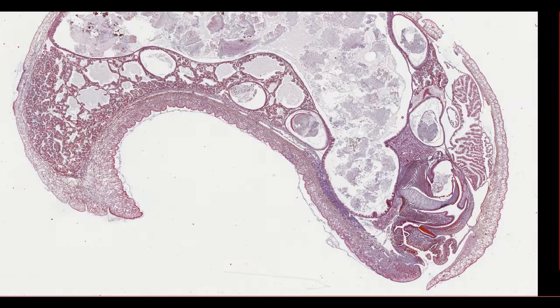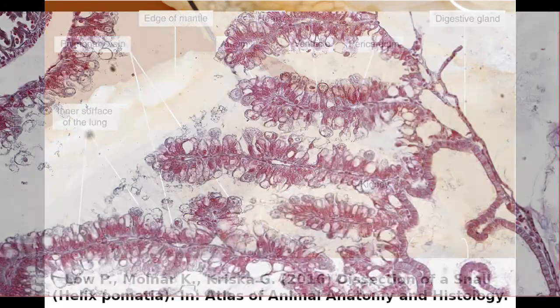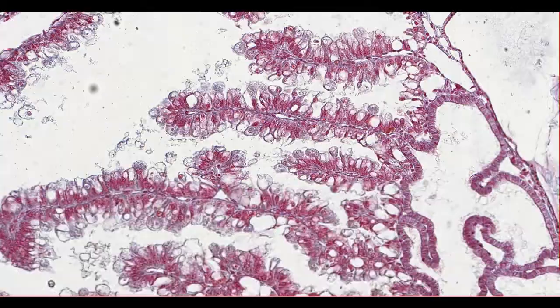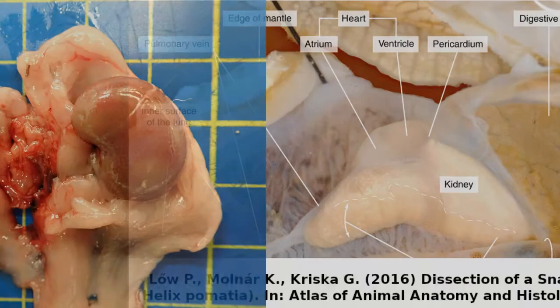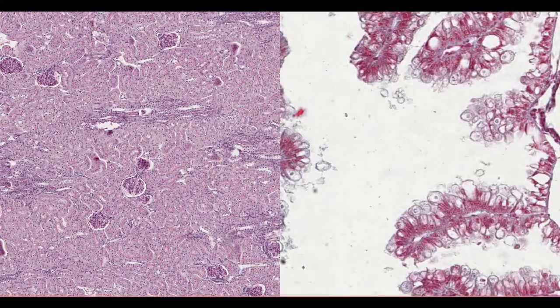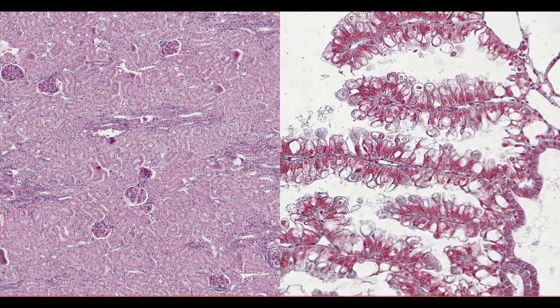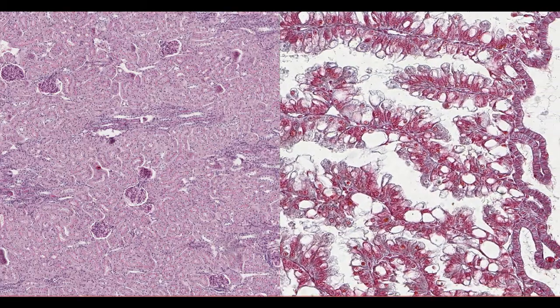Hi everyone and welcome to Down the Scope. This is a snail's kidney and this is what it looks like under the microscope. Compare that to a mammalian kidney and you might be wondering how the snail manages to filter its blood with a seemingly simpler organ system. Here's a quick five-point summary.